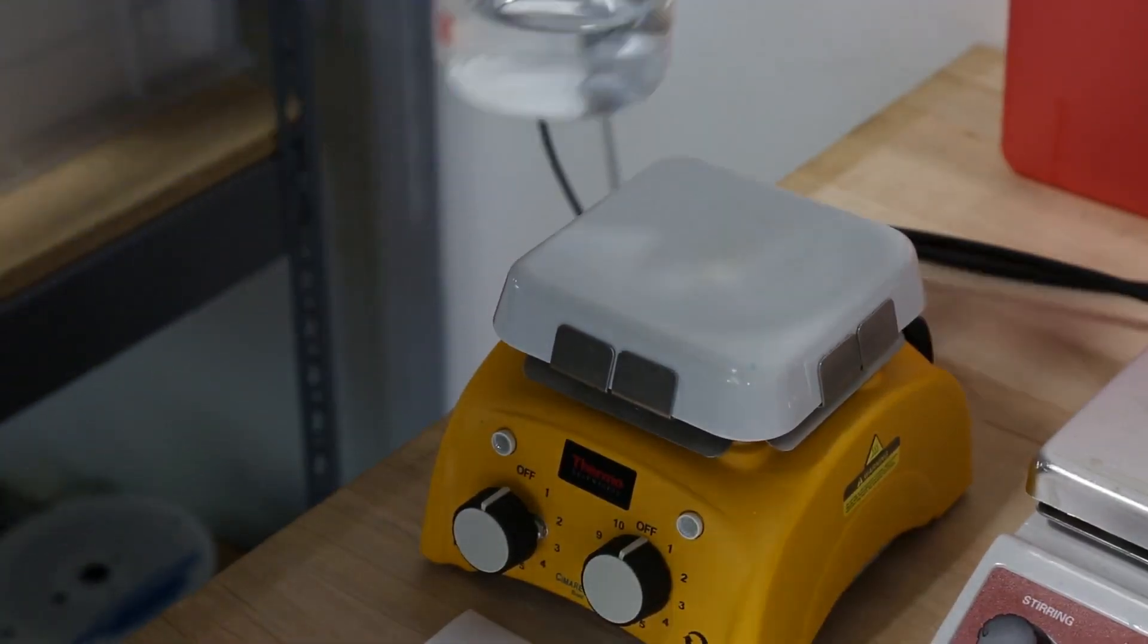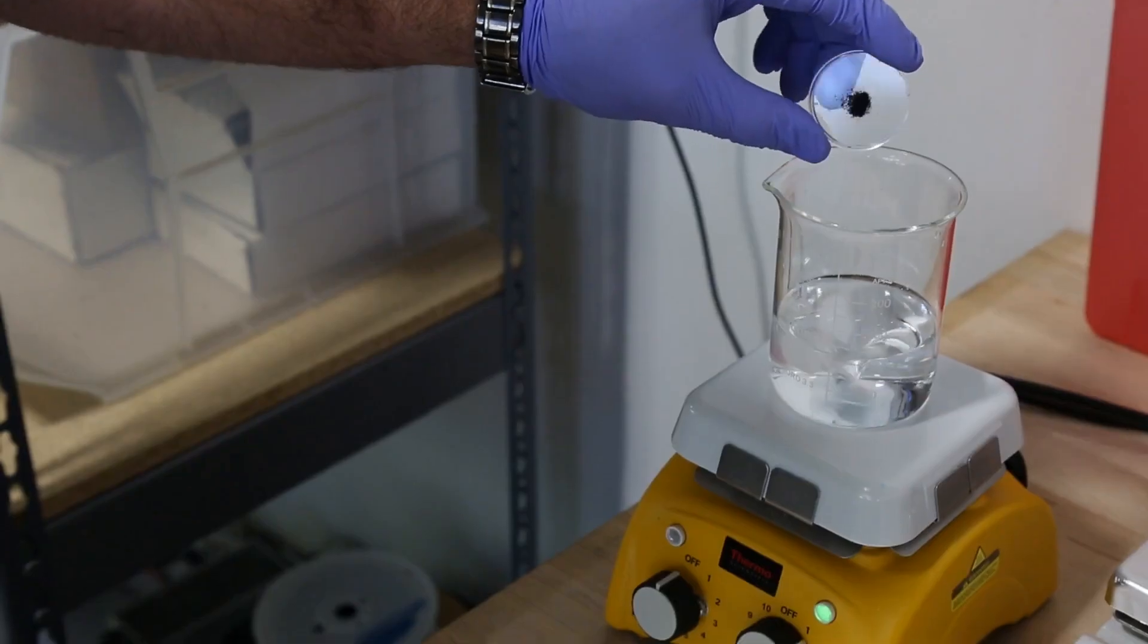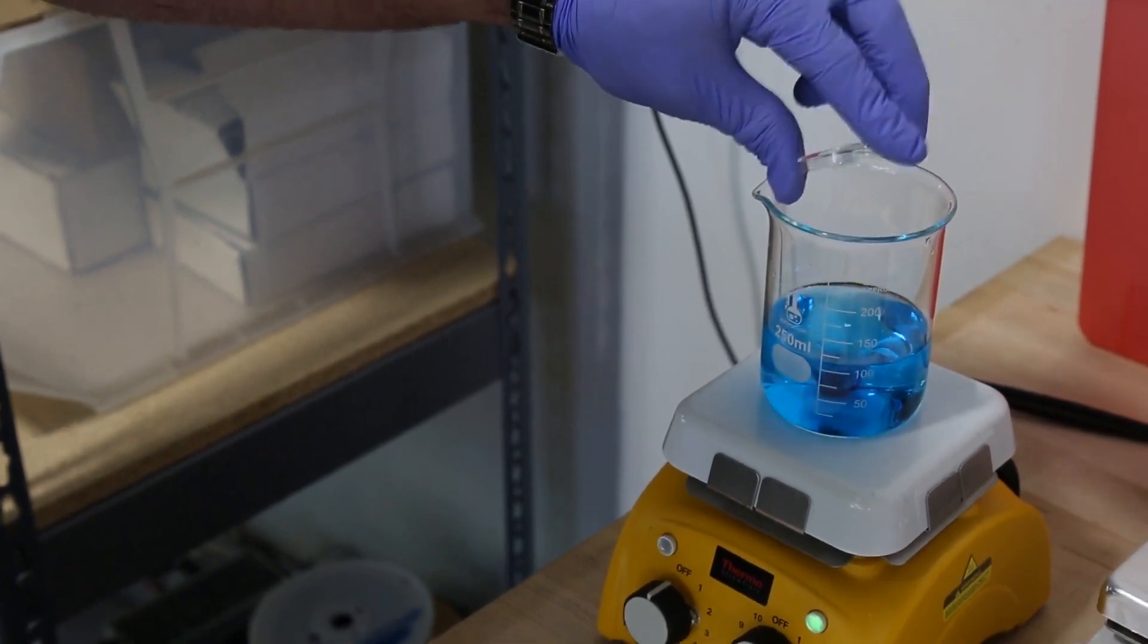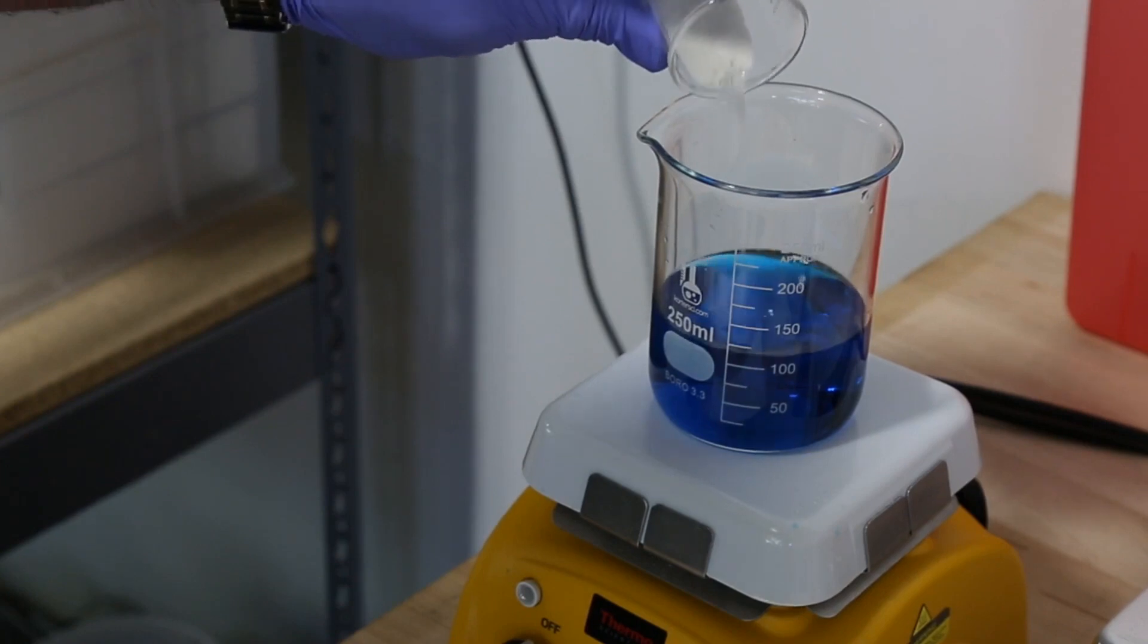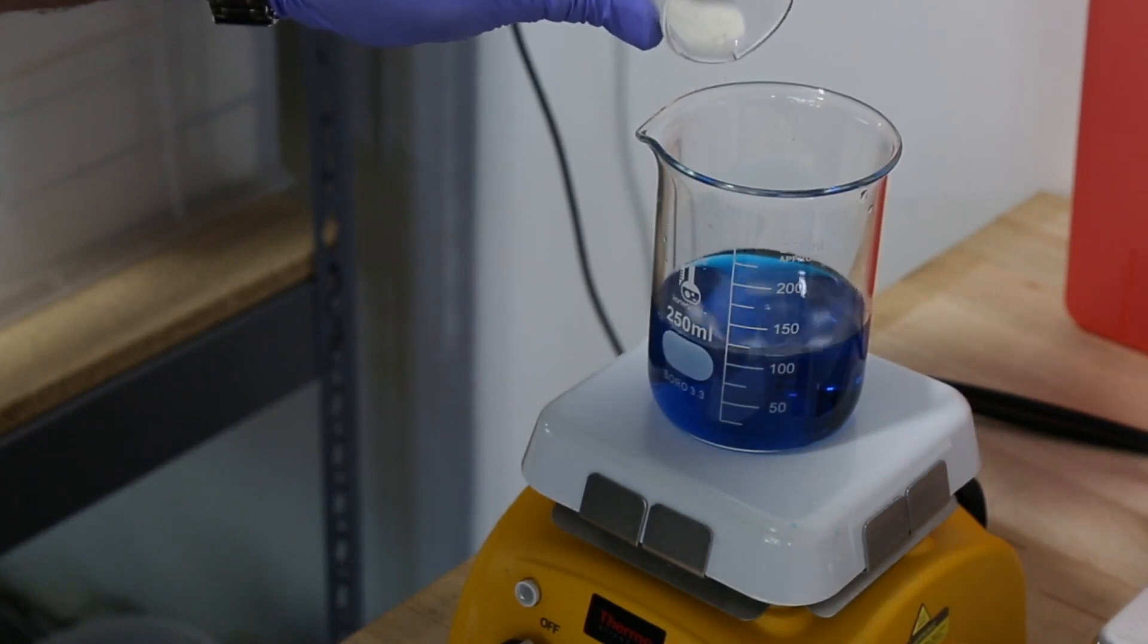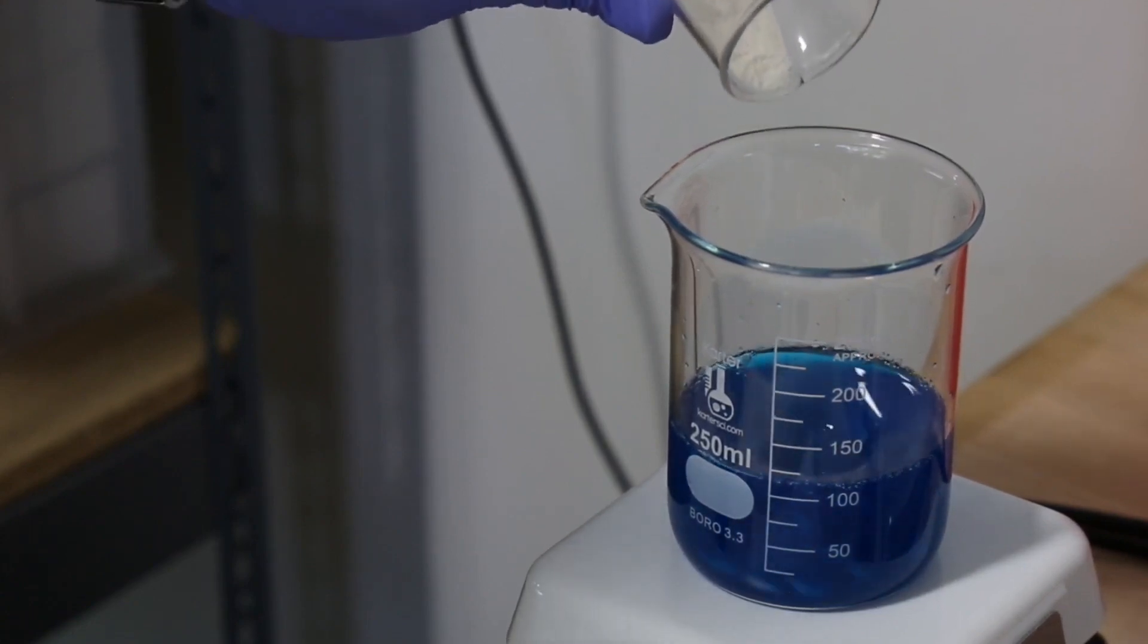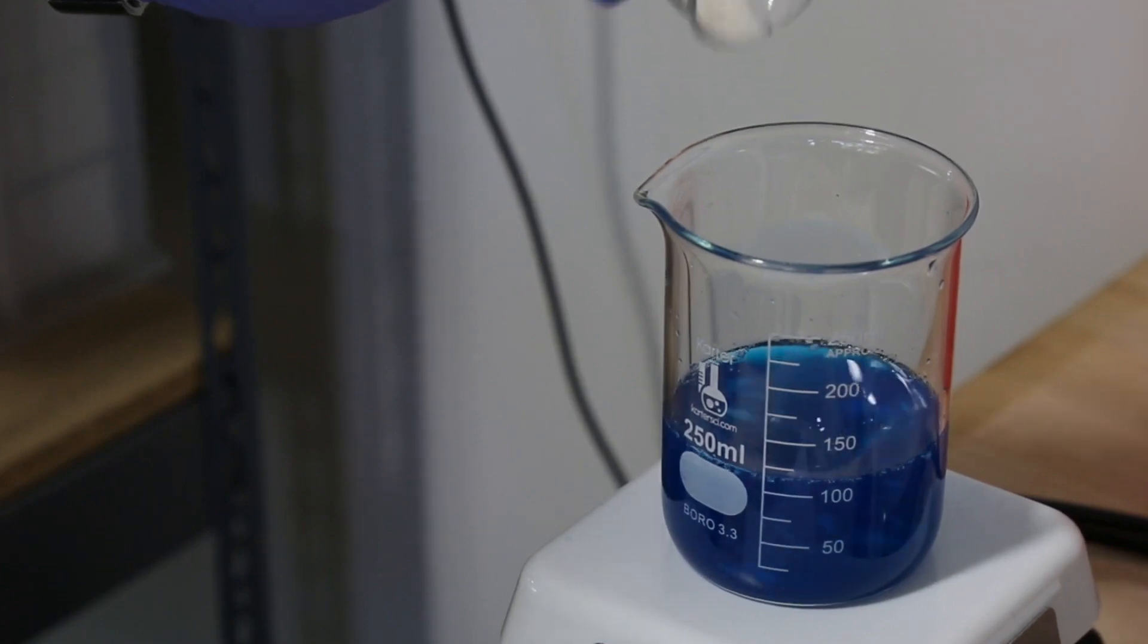So we've got our 98 milliliters of deionized water with a magnetic stirrer. Then we're gonna add our 0.02 grams of Alcyon blue dye, and this stuff is gonna make it really blue really fast. And then we're gonna slowly add our 2 grams of sodium alginate powder. Because the sodium alginate wants to clump together, we're gonna have to slowly add it and mix it for a few hours so that it reaches a consistent viscosity.